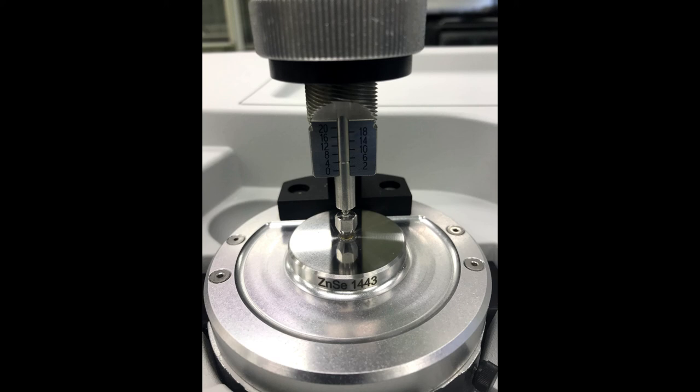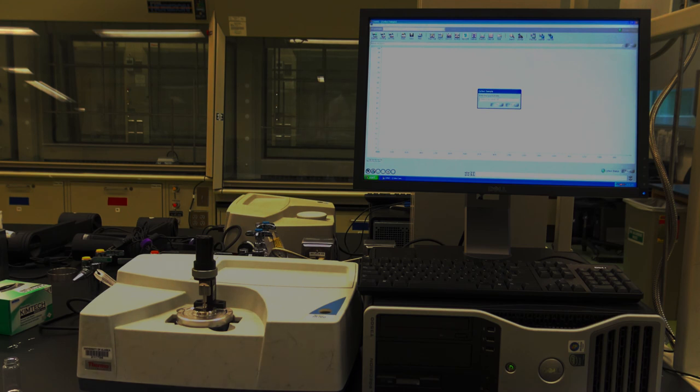This is a close-up view of the sample area. And then I can start my program and start collecting data. And there's my first set of data coming off the system there. Okay. And there's our final spectrum. I will now save that as a PDF file and include that as part of the lab material on Blackboard.